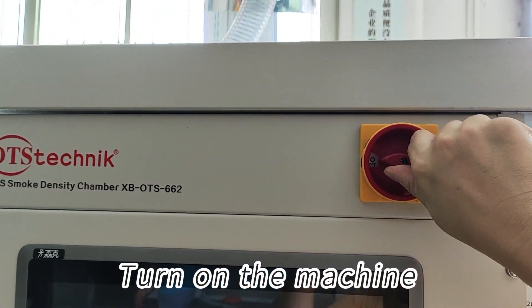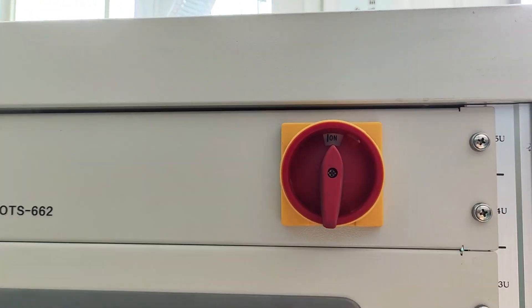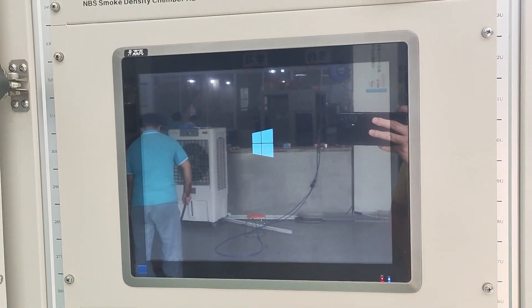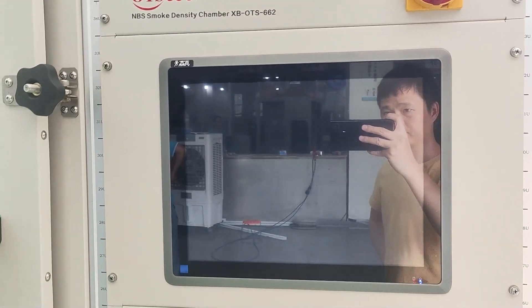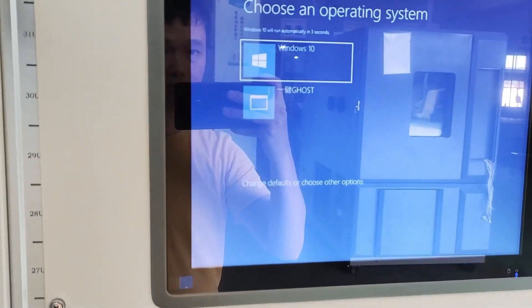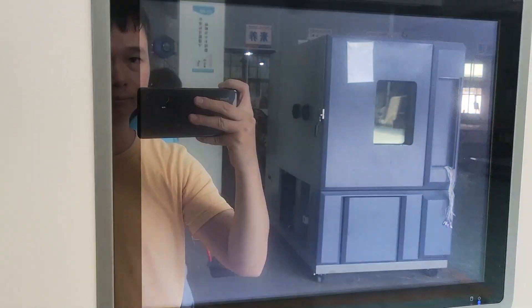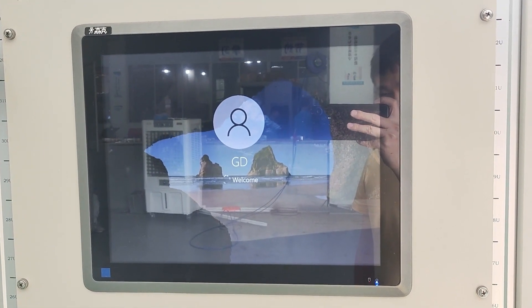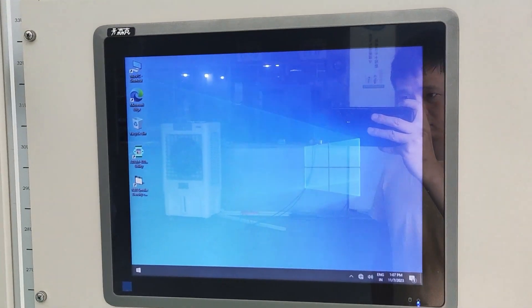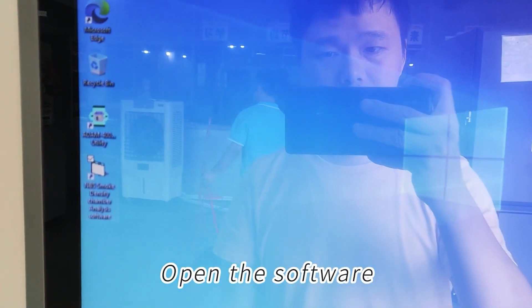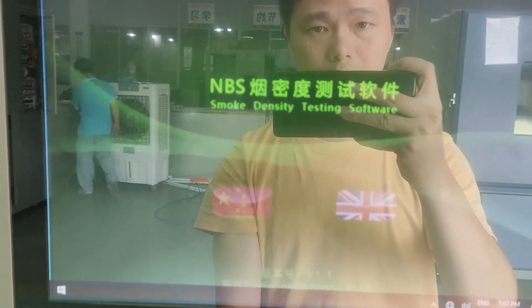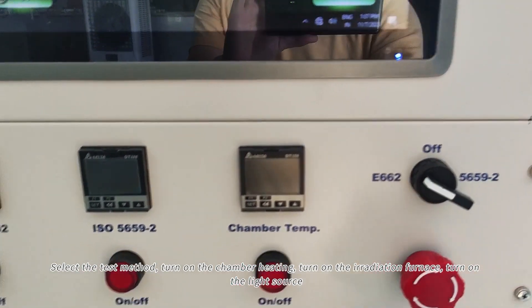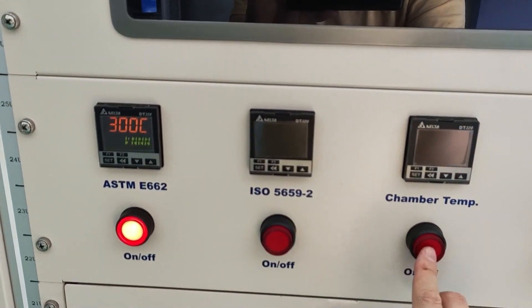Turn on the machine. Open the software. Select the test method. Turn on the chamber heating. Turn on the irradiation furnace and turn on the light source.